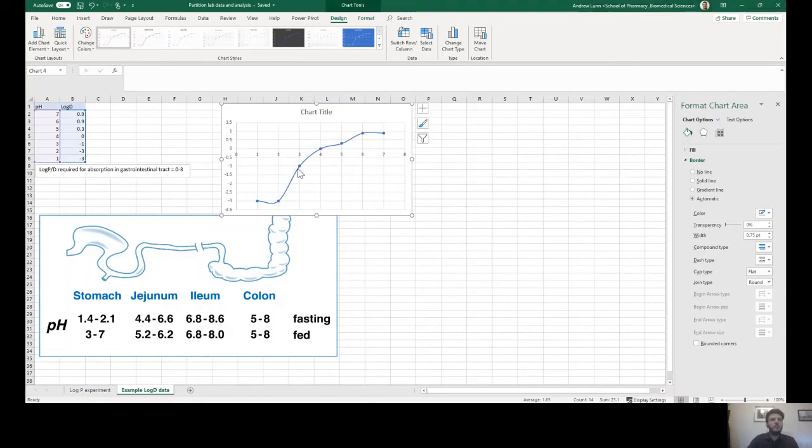And then we have a second quite dramatic drop where we have the other groups becoming ionized on trimethoprim between pHs 3 and 2. So below pH 2, everything is ionized, all of the basic groups have got an extra proton, we have an incredibly ionized molecule, and so it becomes incredibly water soluble instead of soluble in oil or organics. And so we can say then that the two pKa's of trimethoprim based on this data are between 5 and 6, and 3 and 2.